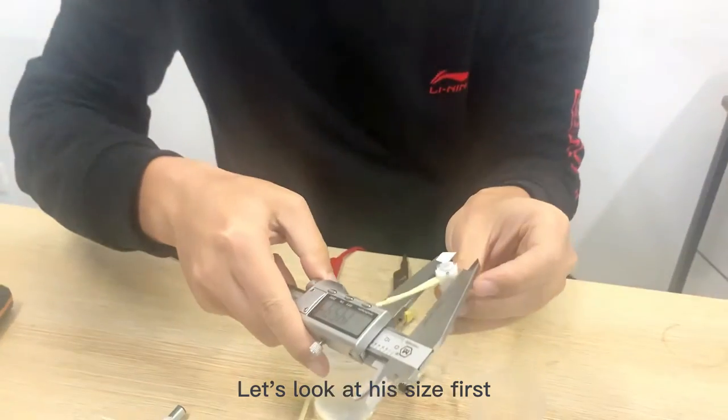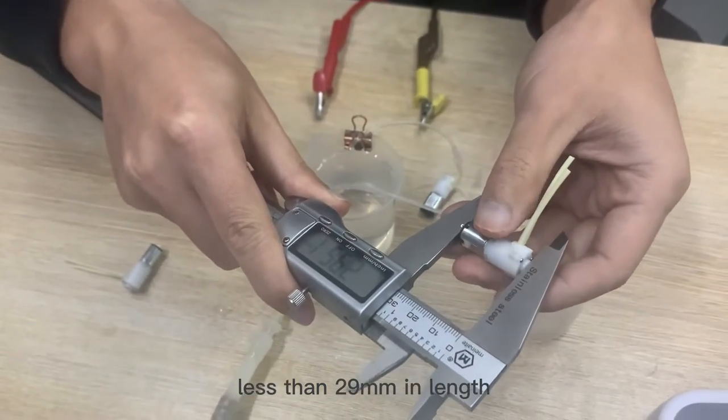Let's look at the specs first: diameter 1.0 mm, length less than 29 mm.